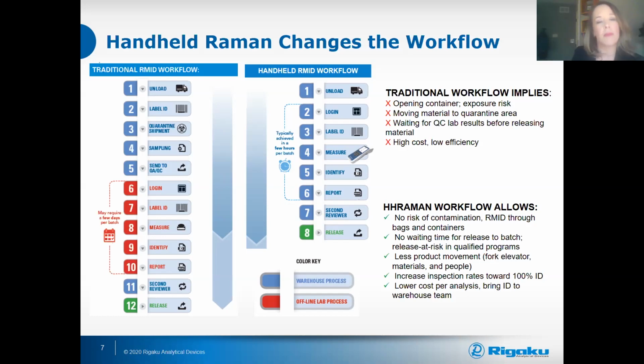It really streamlines the process and reduces the amount of time necessary for the turnaround for the ID process. You're still going to have to go through some compendial tests, but the process of taking product and opening containers is really minimized when you're using Raman for handheld raw material ID.